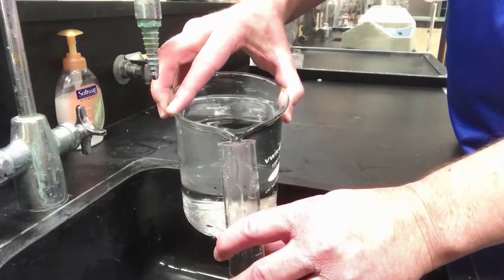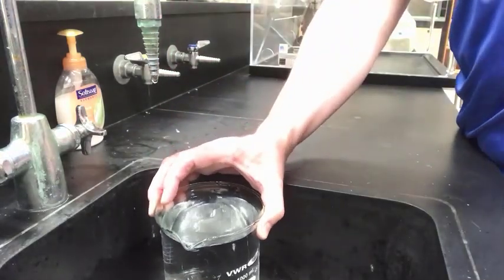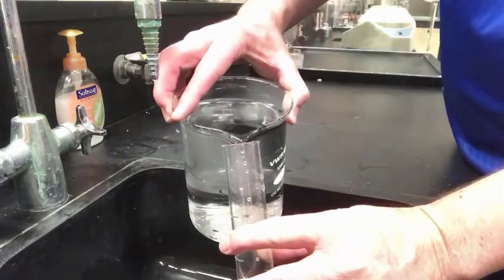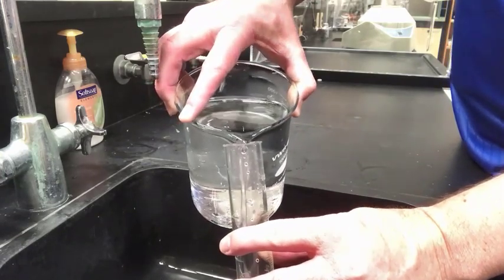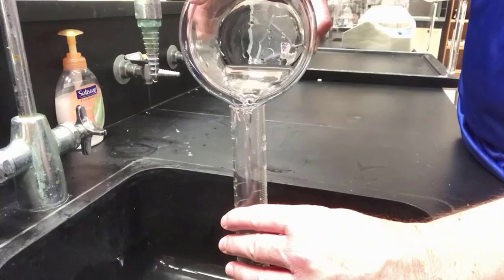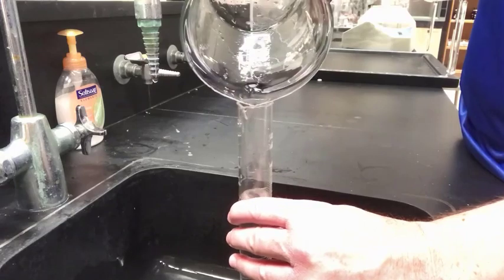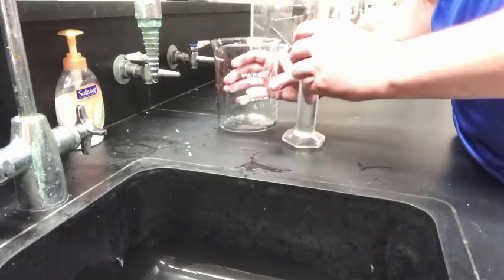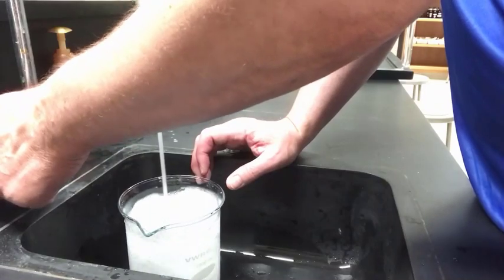And so it's going to take multiple fills. And of course you can only measure 100 milliliters at a time. You don't have to measure 100 milliliters each time. You could measure just 92 or 94, dispose of that in the sink, then fill up the graduated cylinder again, keep going, and keep a tally of the volume until that flat bottom beaker is empty. You'll probably find that the actual total volume of the beaker is very different from the volume mentioned on the side of the beaker.